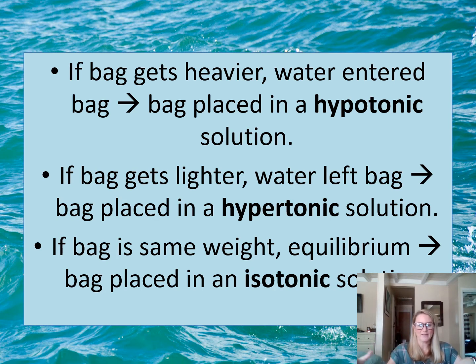Now, say you take the bag out and you notice that the bag got lighter. So you weighed it after it sat in that material and the bag got lighter. That means that water left the bag and you placed your bag in what's called a hypertonic solution, right?